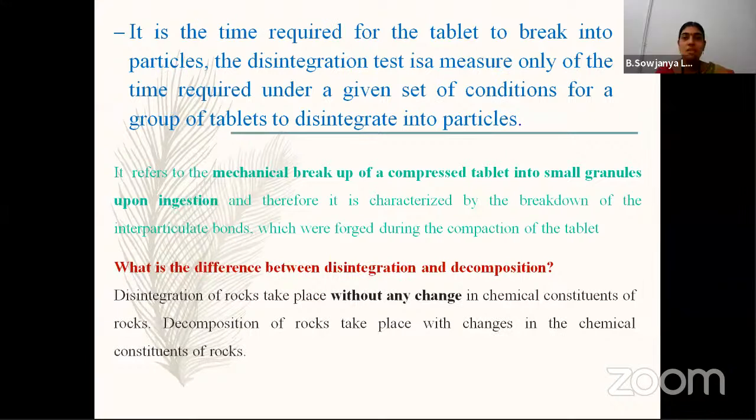The definition includes that when the tablet is placed in a dissolution medium, it breaks into smaller particles. That is simply called disintegration of a tablet: the time required for the tablet to break into particles.